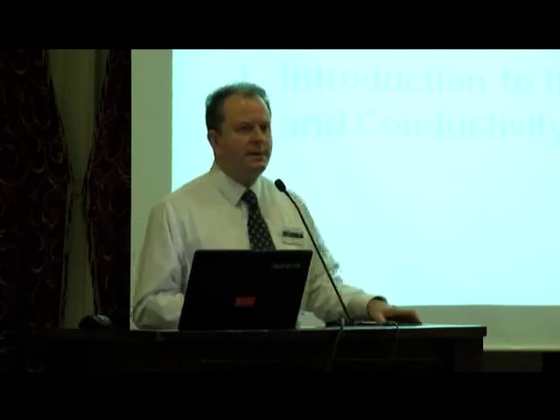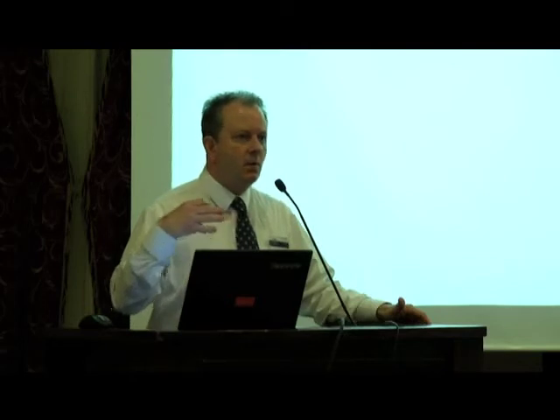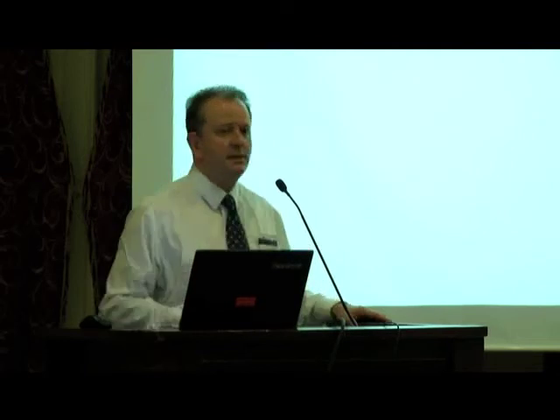So let's take a look at validating a TOC analyzer. First, of course, when you're validating, you need to make sure that the instrument that you're using meets the user requirement specification, obviously. Then you need to make sure it's installed correctly. You need to verify the calibration. Sometimes you will perform a calibration on site. Now remember I said that all TOC analyzers used in pharmaceutical water are conductivity analyzers. So we need to not only verify the TOC, but we need to do the conductivity and the temperature sensor.